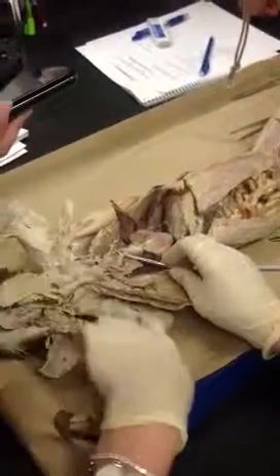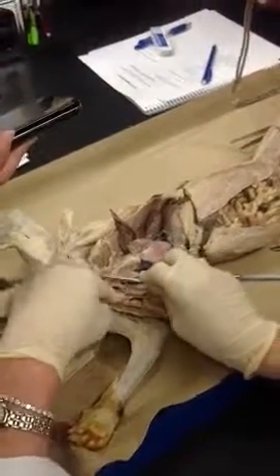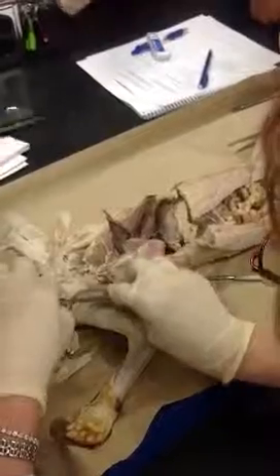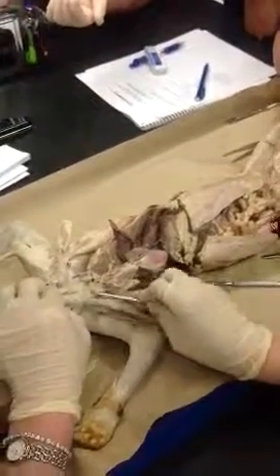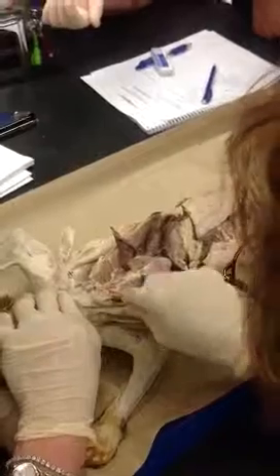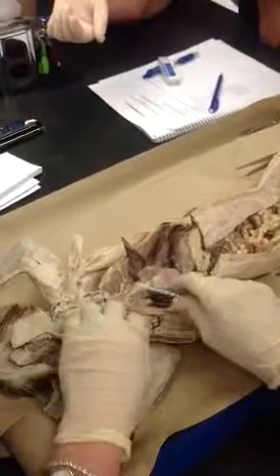We're going to follow down to the right. That's what we're going to do. So we're going to follow, nice little lymph node there. And here's your right common carotid. Comes straight up, and that's the one that you'd see over here on the right side. And one way you can double check this is to come up here and pull on it. See where it pulls, should pull right from there. Make sure you get the right one. That's your right common carotid. Should come right through here.